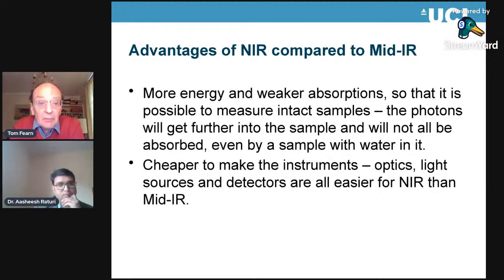So the reason one's interested in using NIR rather than mid-IR is that the photons whose energy levels we're looking at in NIR have more energy, so they will penetrate further into a sample. Mid-IR will not go very far into anything. NIR will not go a whole long way either.